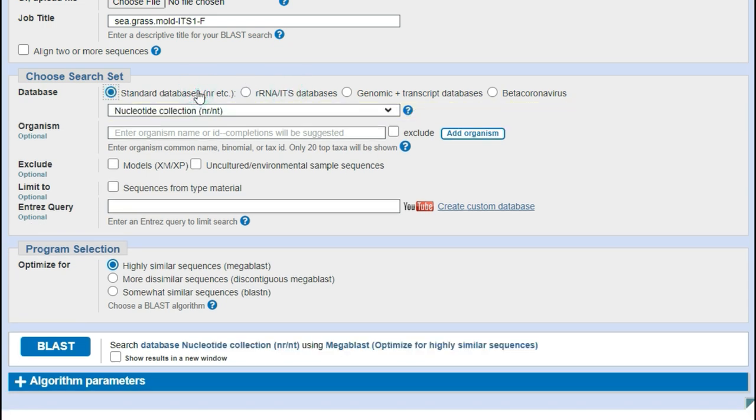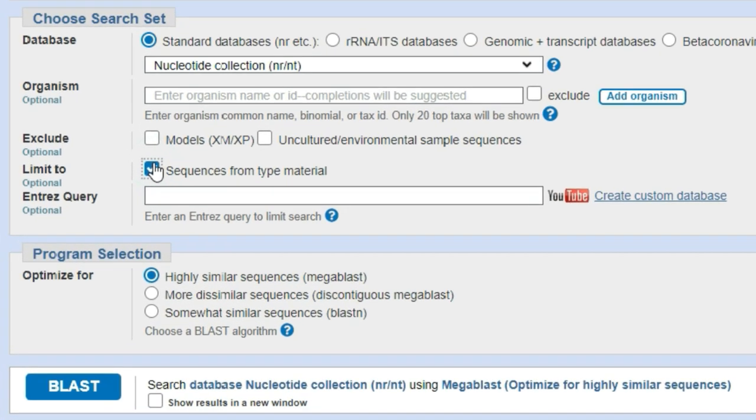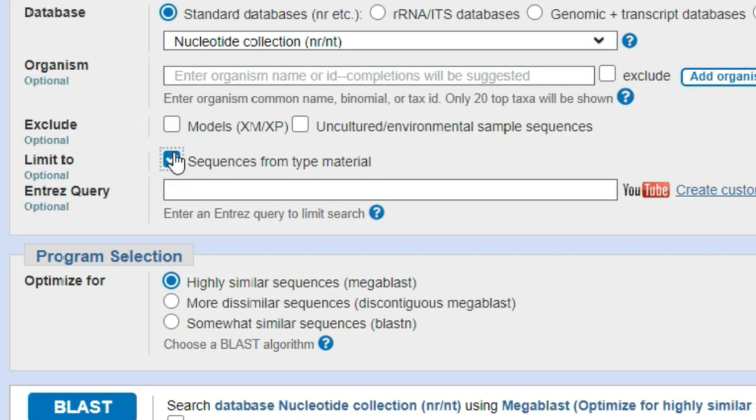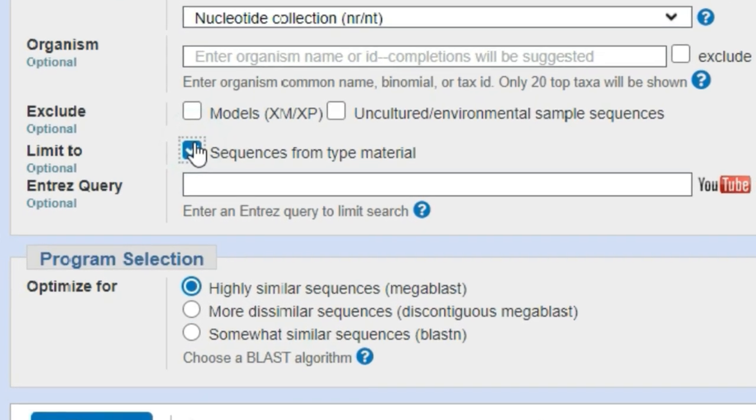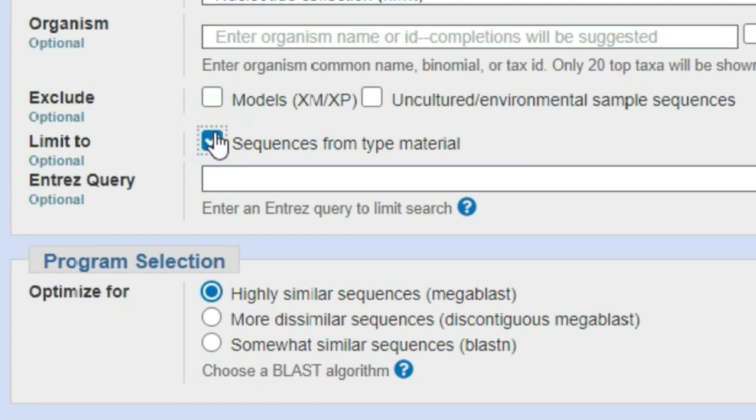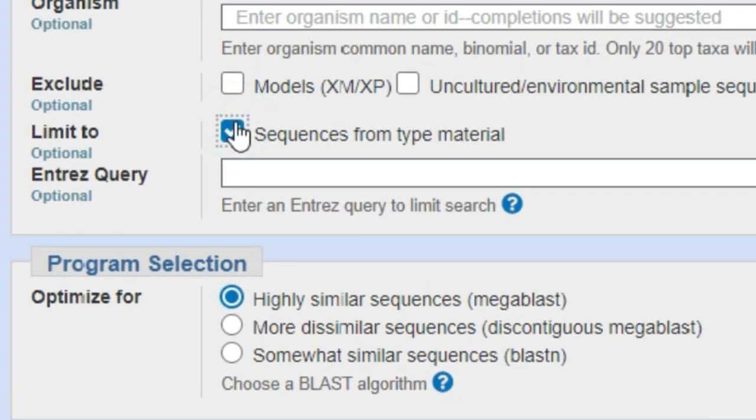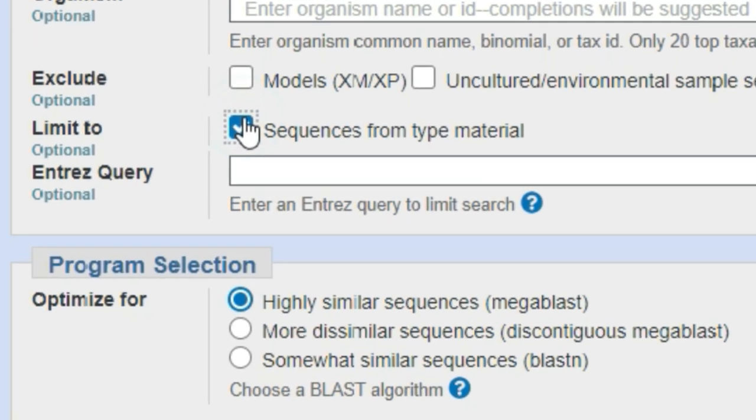And we can start by limiting our search results to comparing our sequence with only sequences that came from known type material. Type materials are basically reference species that are assured to have correct IDs and related sequences in the database.